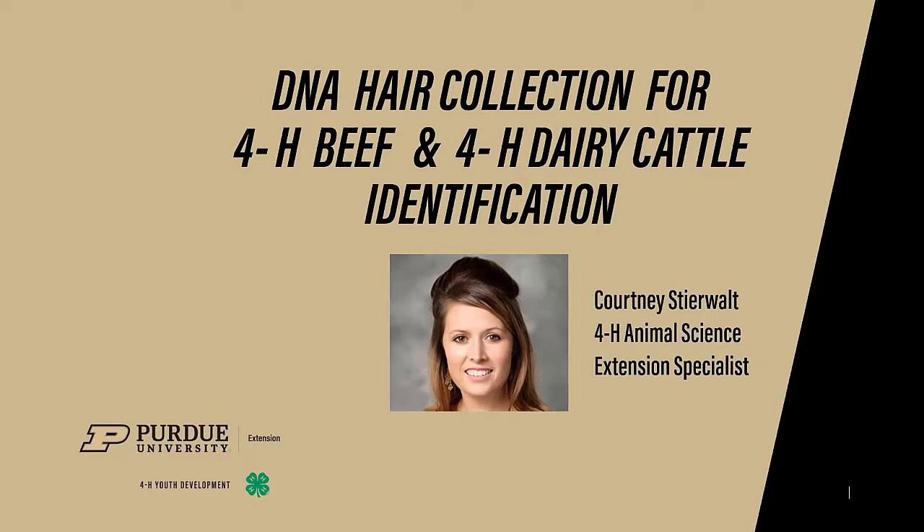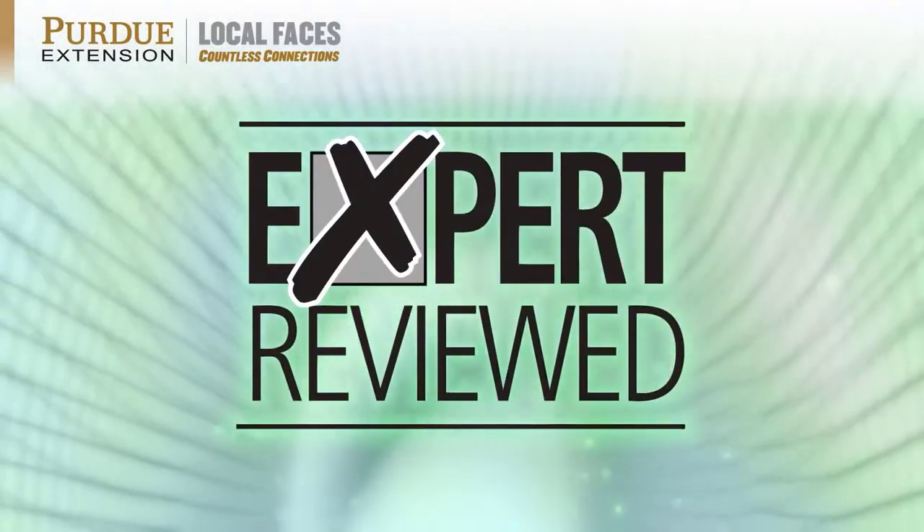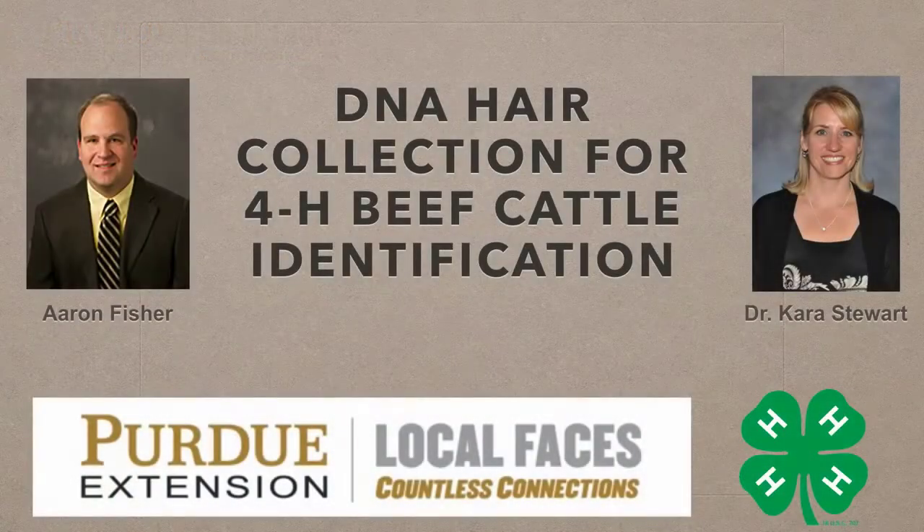Thank you, and if you have any questions be sure to contact your local Extension Office. I'm Dr. Kara Stewart from Purdue University. The purpose of this video is to demonstrate how to properly collect the hair sample from your 4-H beef cattle project.